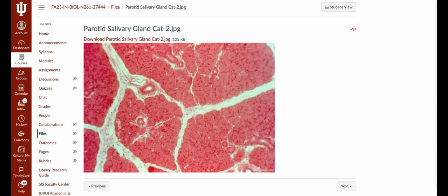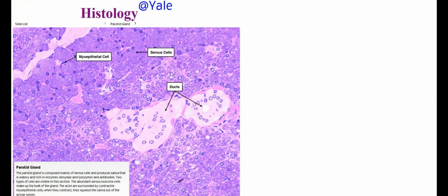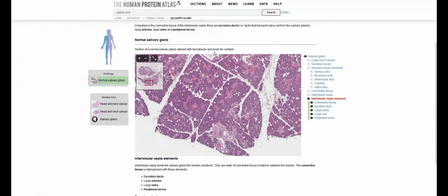When you are studying for the lab exam, I would definitely recommend using the Yale Histology site for the salivary glands, and then the two other types of tissue we will look at in the next few videos have really good resources on the Human Protein Atlas.